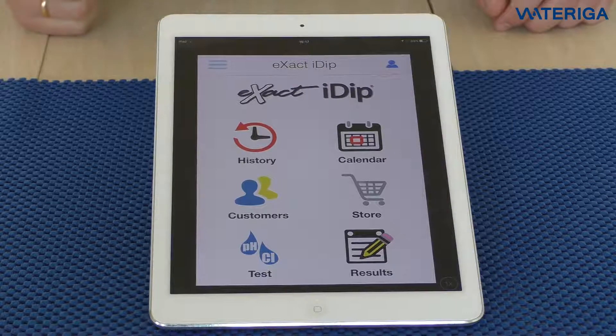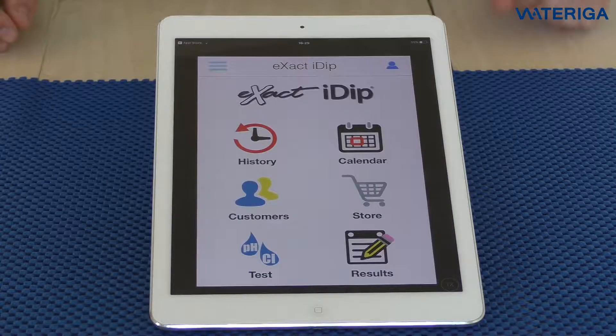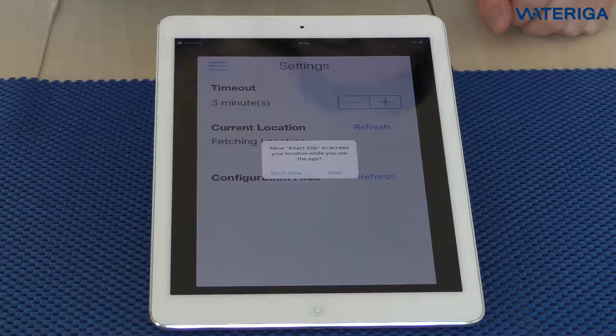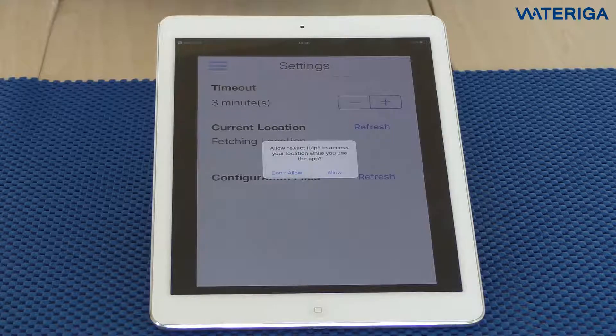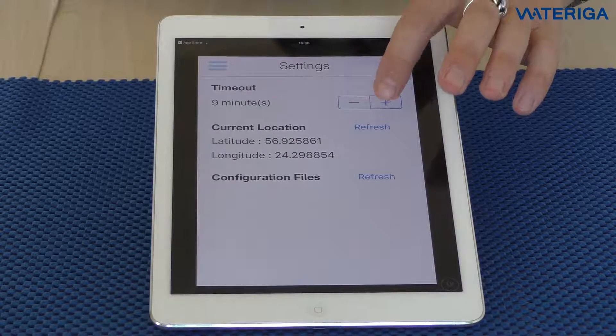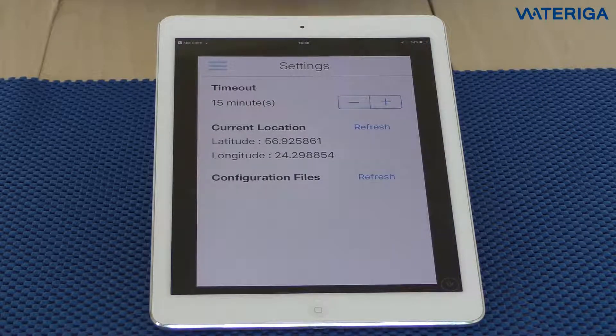You're then directed to the Xact i-Dip home screen. When you first open the app, I would suggest you go into settings. It asks you to confirm location settings — hit allow. This will enable GPS coordinates for your test results. There's also a timeout timer you can set higher or lower. If you're just starting, I would suggest increasing the timeout to a larger number, as it determines how many minutes before the app tells the i-Dip to shut off.